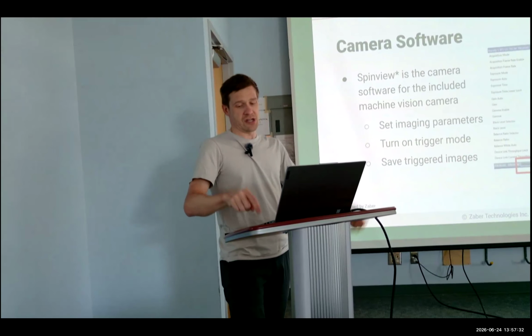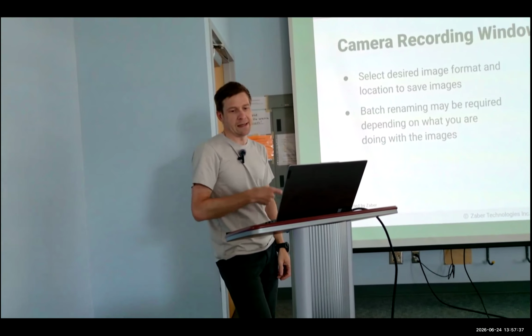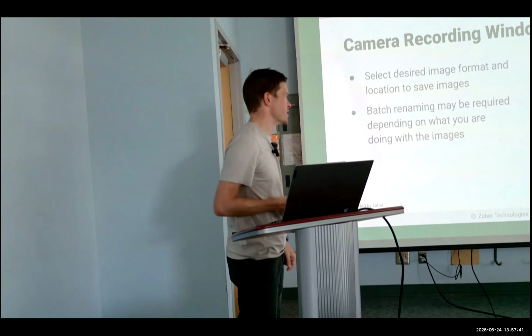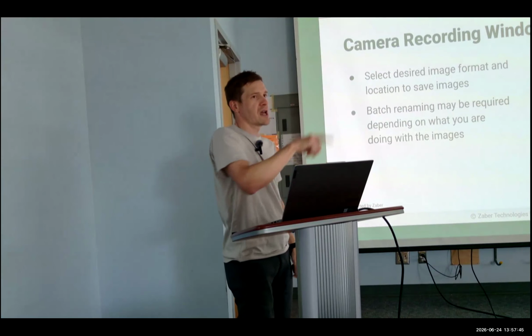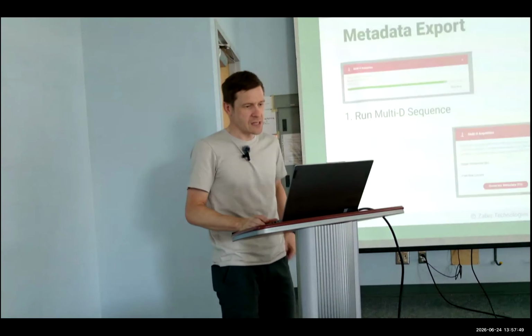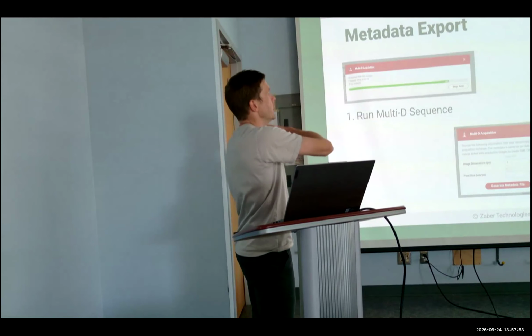And then you just have to set up in the camera recording window where you want to put the images that you save, and then every time our software triggers the camera, it'll save the image. And so it's pretty straightforward. The automated acquisition will run.